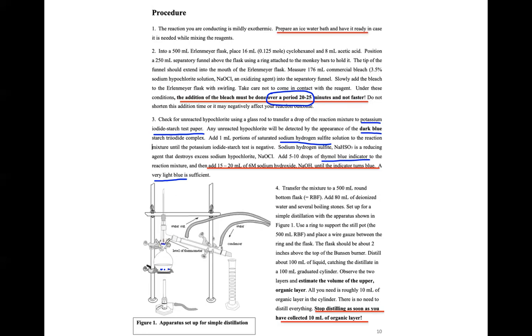So this is where the thermometer needs to be. It should not reach into your flask or anything. The tubing that has water flow through the condenser over here should be far away from the Bunsen burner flame. Obviously, you don't want the tubes to catch fire, and water will go everywhere and it will be quite a mess, okay? You're going to collect your distillate in a cylinder over here to the right side of this schematic.